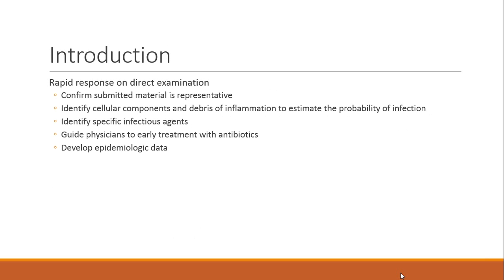Okay, so the gram stain gives us a way to rapidly give the physician a result so he or she can act on it. They can treat the patient with appropriate antibiotics based on the morphology of the organisms that we see.